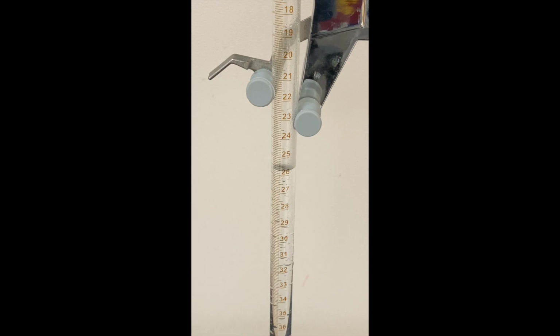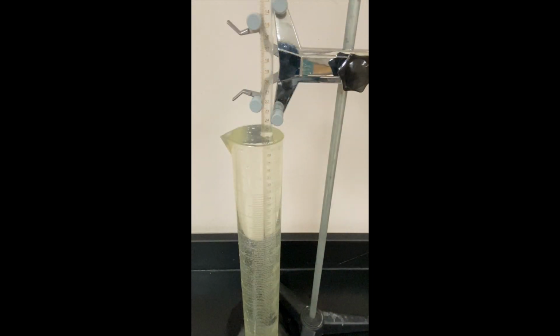So we're going to put this into a 1,000 milliliter graduated cylinder with water, and we're going to move it down to where the two water levels are the same so that the pressure is equal, and then we will take our volume reading. All right, now I have lowered my eudiometer into the 1,000 milliliter graduated cylinder. And what that will do is ensure that the inside of the tube is at the same pressure as the atmospheric pressure outside of the tube.